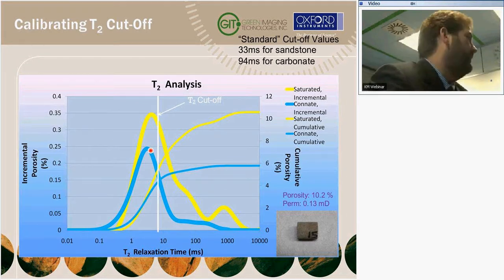I just stated the existing logging tools. I know the companies have come up with different techniques. They've pushed ultra short TEs and all that sort of thing, and the whole goal of all of these techniques is to start to see some of those signals. What I can tell you about the laboratory equipment is that the new generation of laboratory equipment can definitely see those signals. Which in my mind means if the tools aren't there yet, they will be. So I can't answer it directly. I'm not sure whether the logging tools can do it. I know lab equipment can. Thank you.